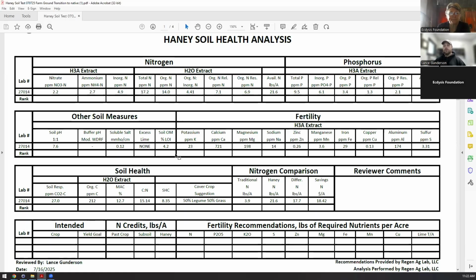Now, one of the things I do know about this system, because Lynette was kind enough to tell me, is that this is a perennial system going back to native range, native plants, native prairie. Native prairie systems typically do have a ratio that will climb, and it should continue to climb, Lynette, as it matures. You're going to get there between 15 to 1 and 20 to 1 because these are very nitrogen low systems, and what little protein is being introduced back to the soil quickly gets converted into nitrate and ammonium and taken up by the next growing plant.